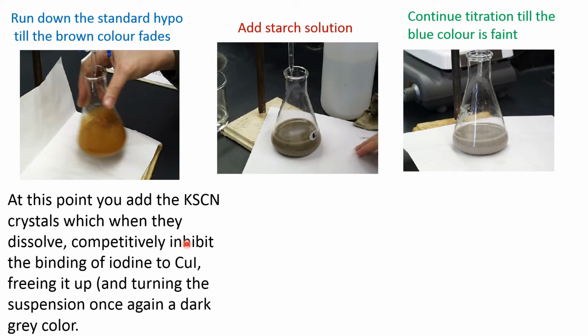To remove or to make free those adsorbed iodine from the surface of the solid Cu plus iodide, you have to add this ammonium thiocyanate or potassium thiocyanate. So, this is another Viva question: why do you have to add potassium thiocyanate or ammonium thiocyanate?